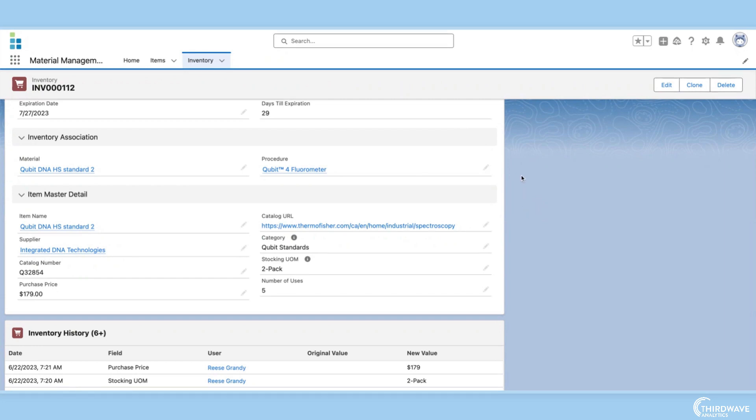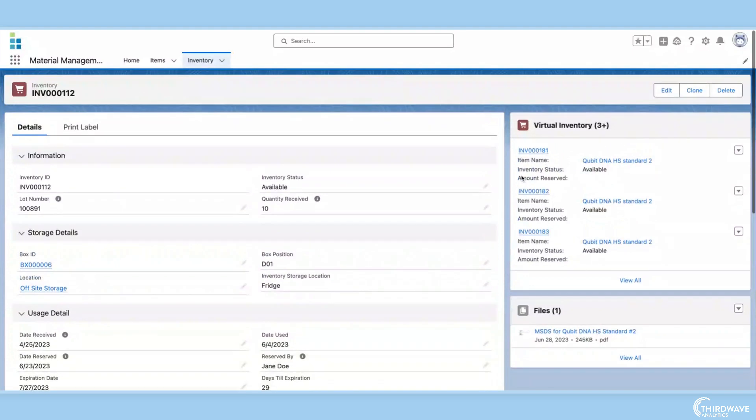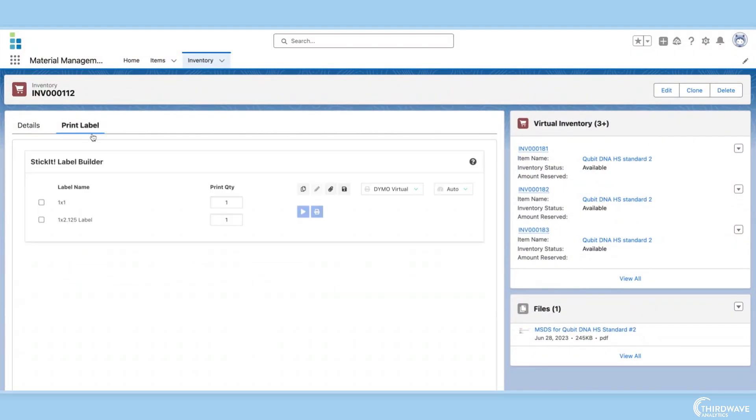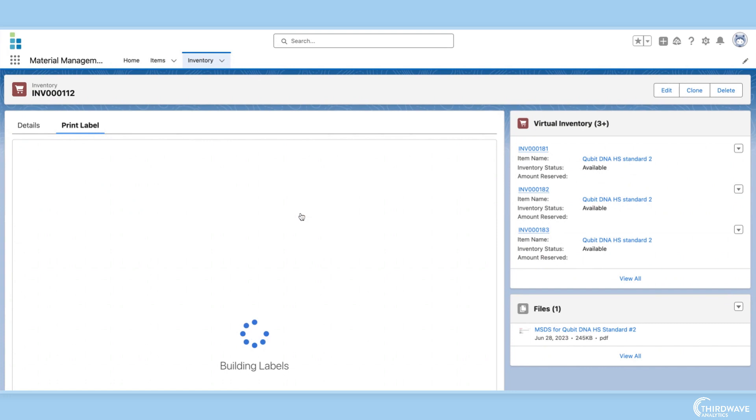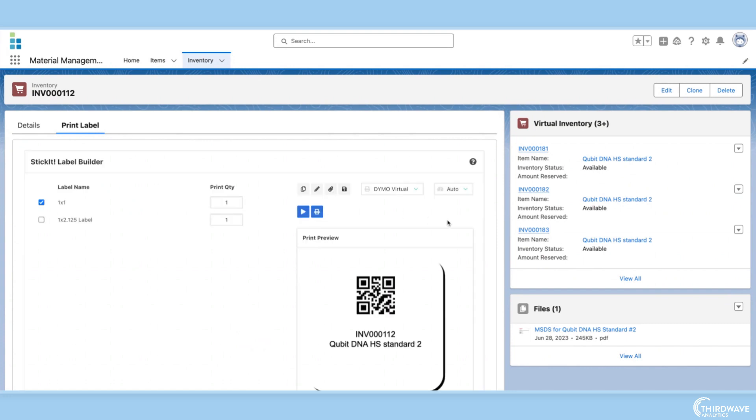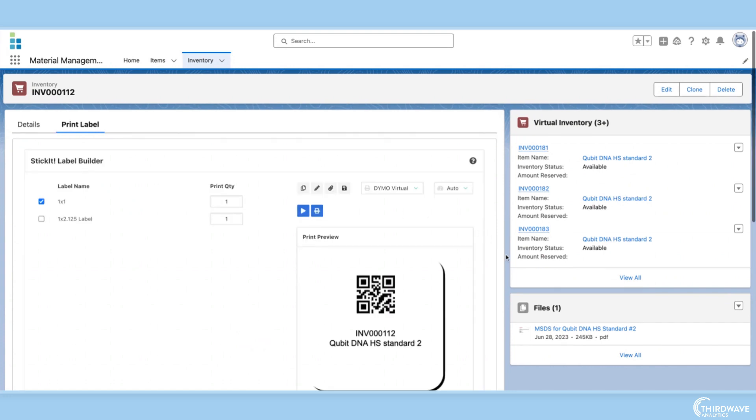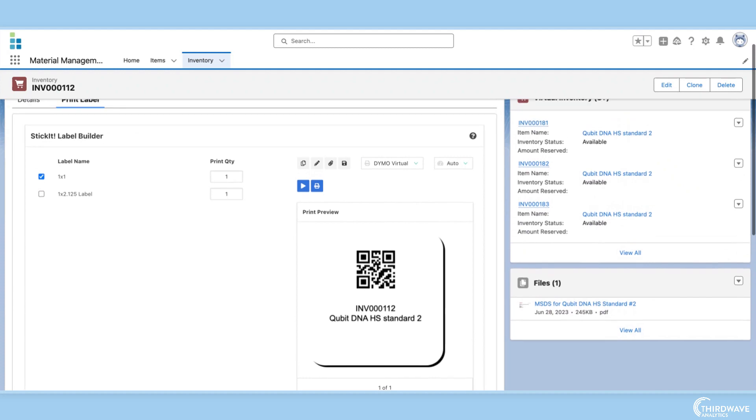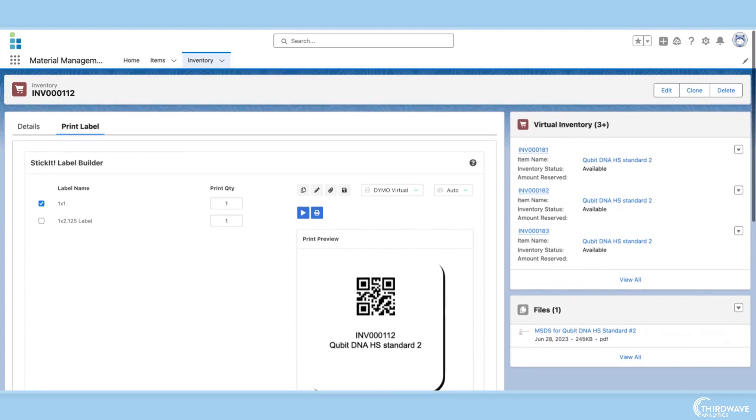The final feature of Lockbox LIMS inventory management capabilities is barcode scanning. Just like with samples, Lockbox can generate barcodes for inventory items. This allows items to be scanned into the system when received, consumed during testing, or moved throughout the lab.